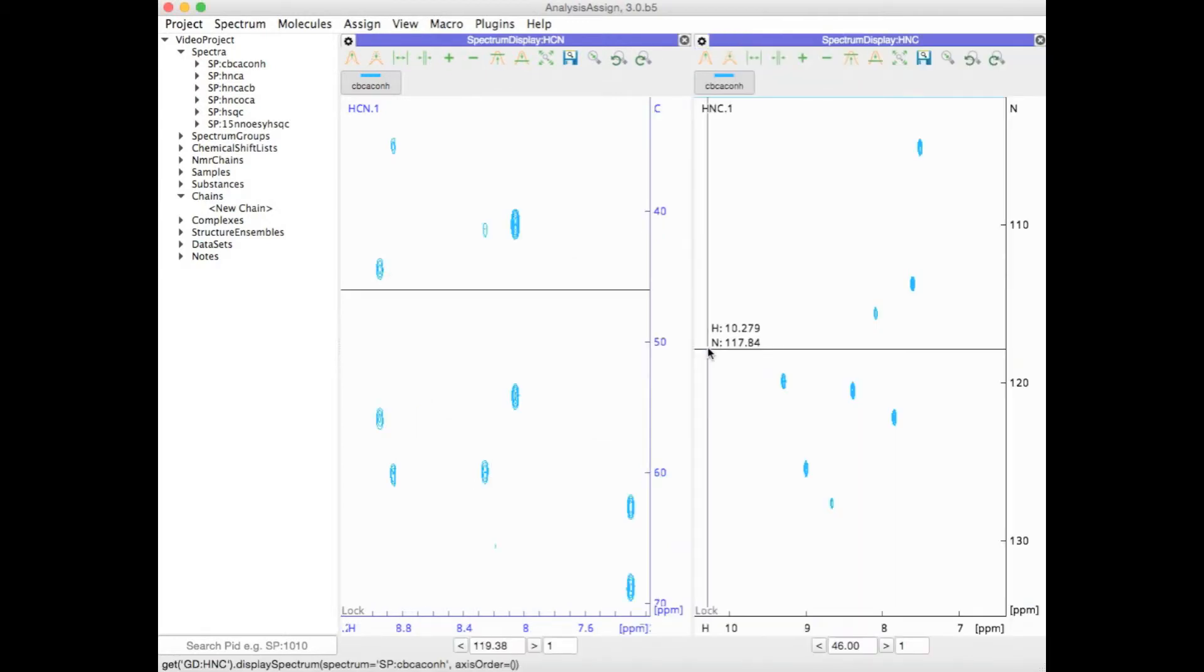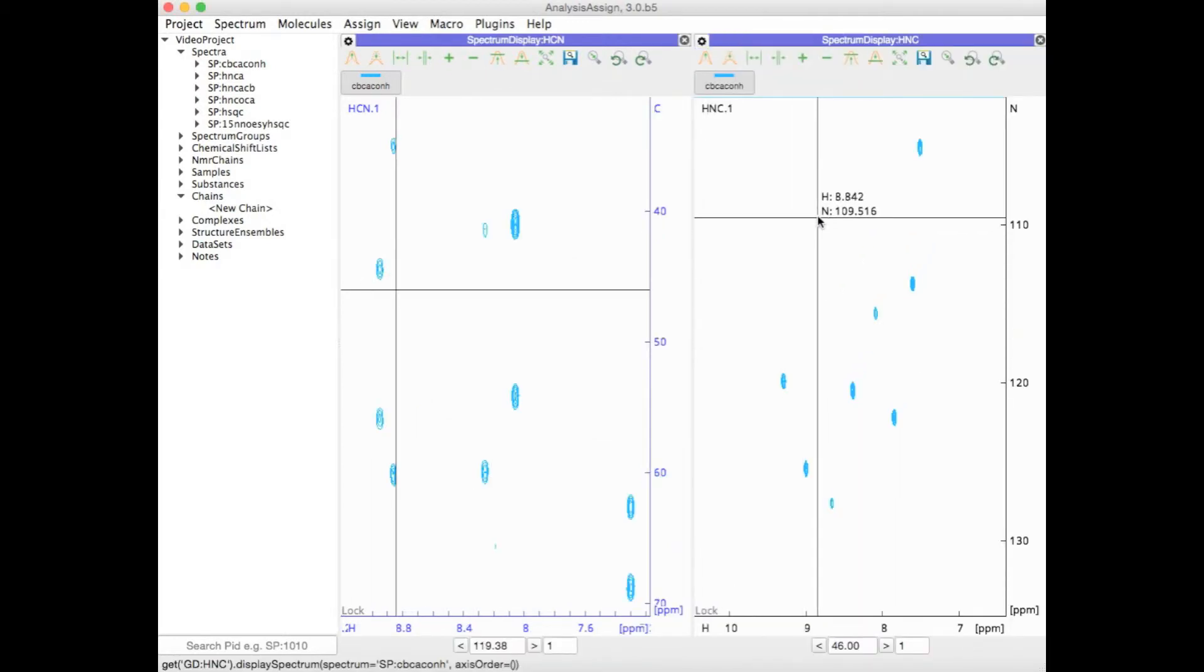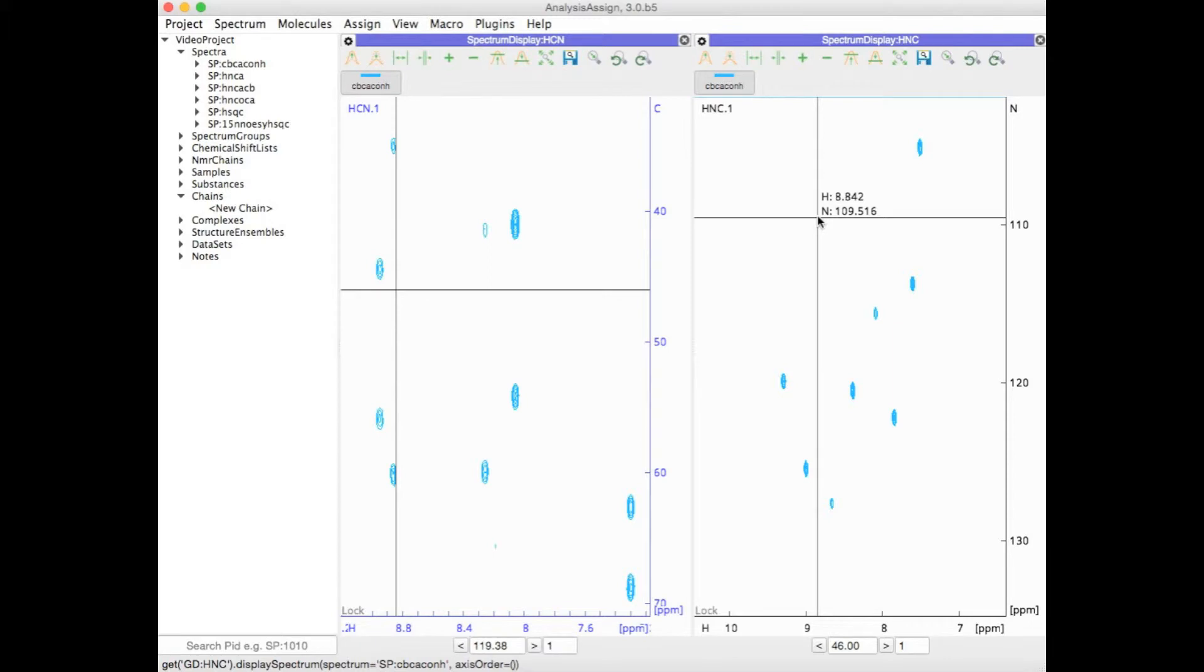Click OK and your new module will be generated. This is particularly useful for 4D spectra or even higher dimensionality spectra, where you'll have several Z dimensions and we can't offer shortcuts for every possible combination of swapping axes.